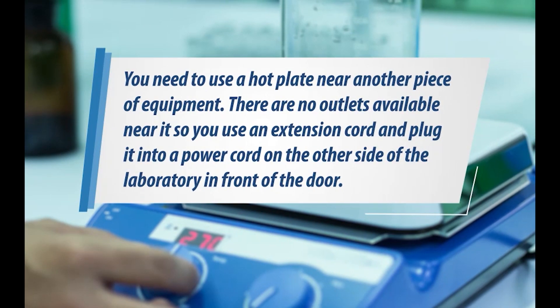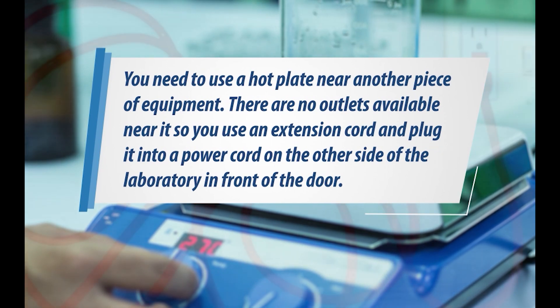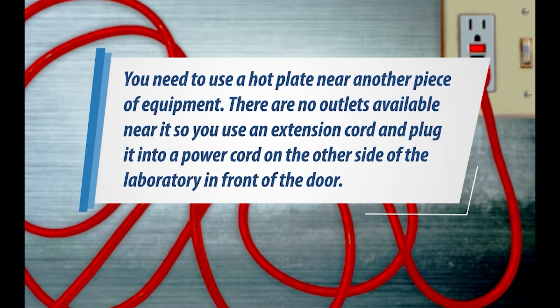You need to use a hot plate near another piece of equipment. There are no outlets available near it, so you use an extension cord and plug it into a power cord on the other side of the laboratory, in front of the door.